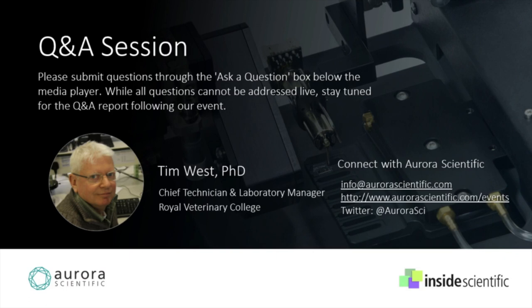Well, we don't do anything all that special. We have a suction device that deposits the solution volume into a vacuum flask. With one hand we're flooding the chamber with water and with the other hand we're sucking it away from the chamber. Really all we ever use is deionized water to clear the chamber, or if we're clearing out one particular solution after a fiber and changing solutions.